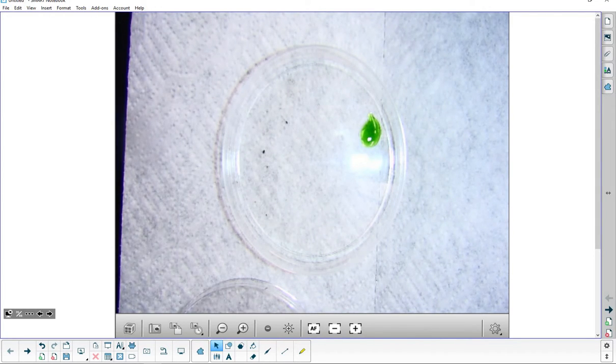Then you want to put one of them down. Now this is important on this one. You need to have the same number of drops. So if you're changing concentration and I want to have a total of 6 drops, I could do 1 drop of one and 5 of the other. Or I could do 2 and 4. Or I could do 3 and 3. Or I could do 4 and 2. Or I could do 5 and 1.